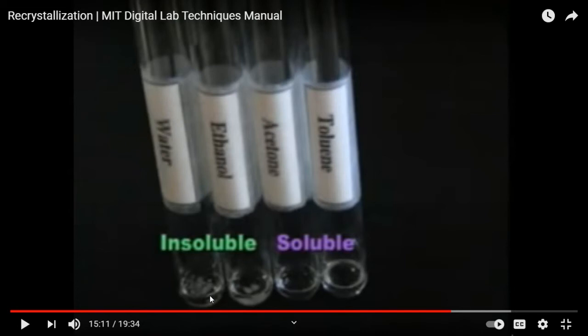That's the technique. But we have only a few common organic solvents with different polarity, and you test out every single one of them. And some compounds are not behaving the proper way. You cannot do crystallization, and you need to do it. That's when you think of it. Oh yeah, I heard about those things from that tough guy. Whose name? The Asian guy? Dr. Lee? Yeah, that guy said something about mixing the thing. Oh yeah, there was a way when this doesn't work. There is a method. Okay, that's enough.